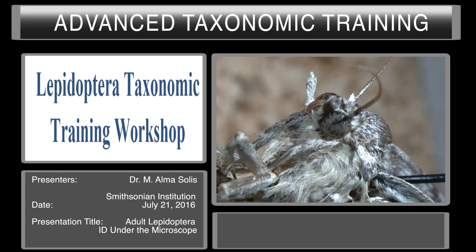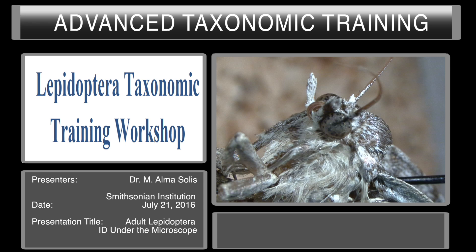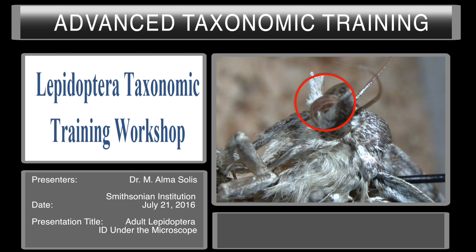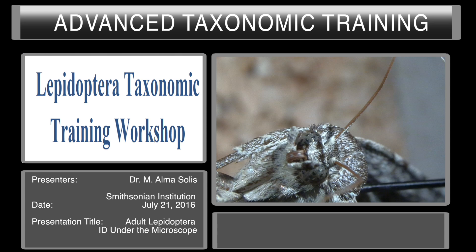The first thing I do when I get a moth, whether it has scales or not, is I look at the base of the proboscis. So first let's look at a smooth proboscis. What we have here is the head of a moth, and you can see the proboscis right here. This is a smooth proboscis, and here is the head-on view of the same proboscis — it is absolutely smooth. After you compare this to a moth with scales at the base of the proboscis, you'll see the difference.